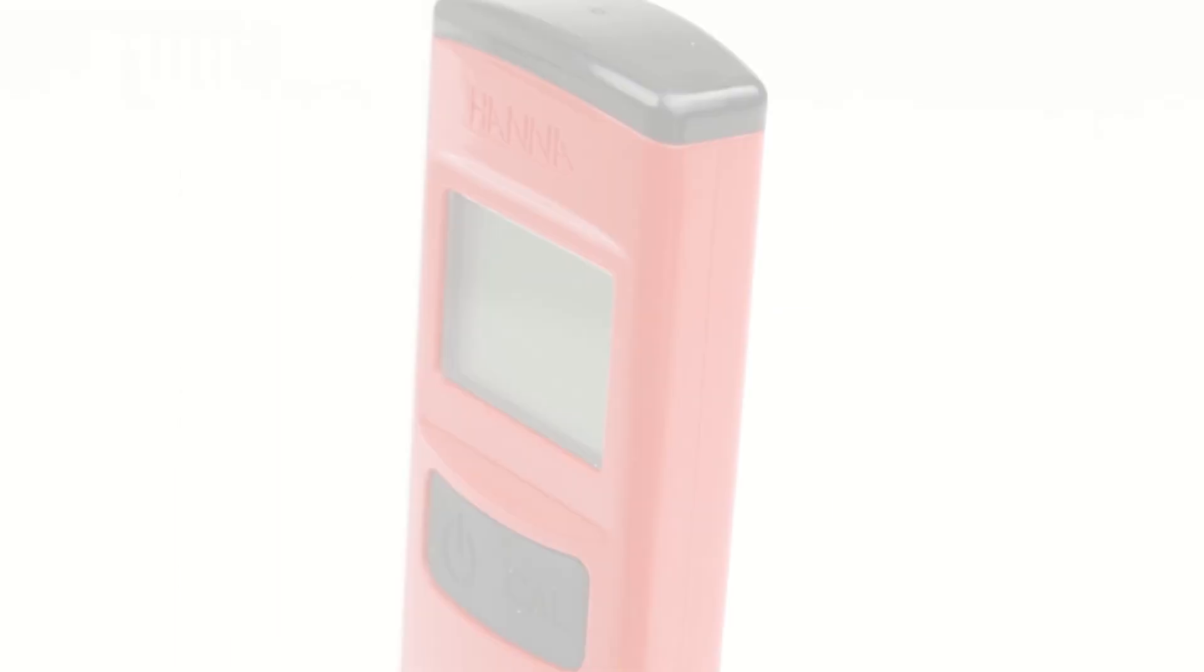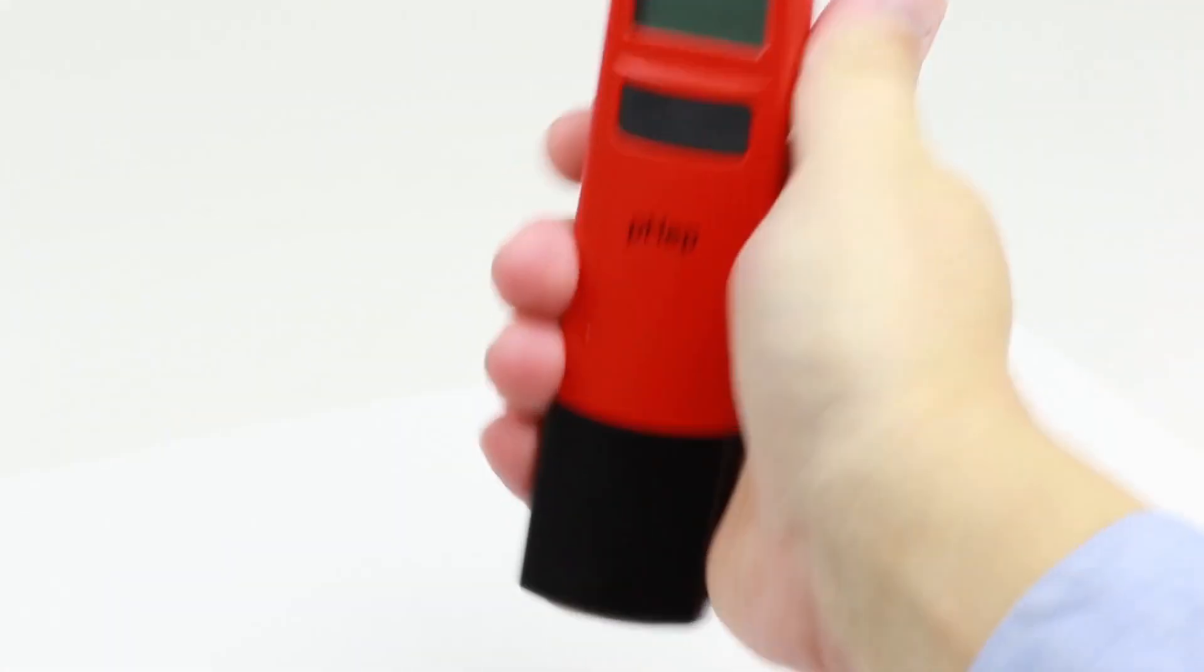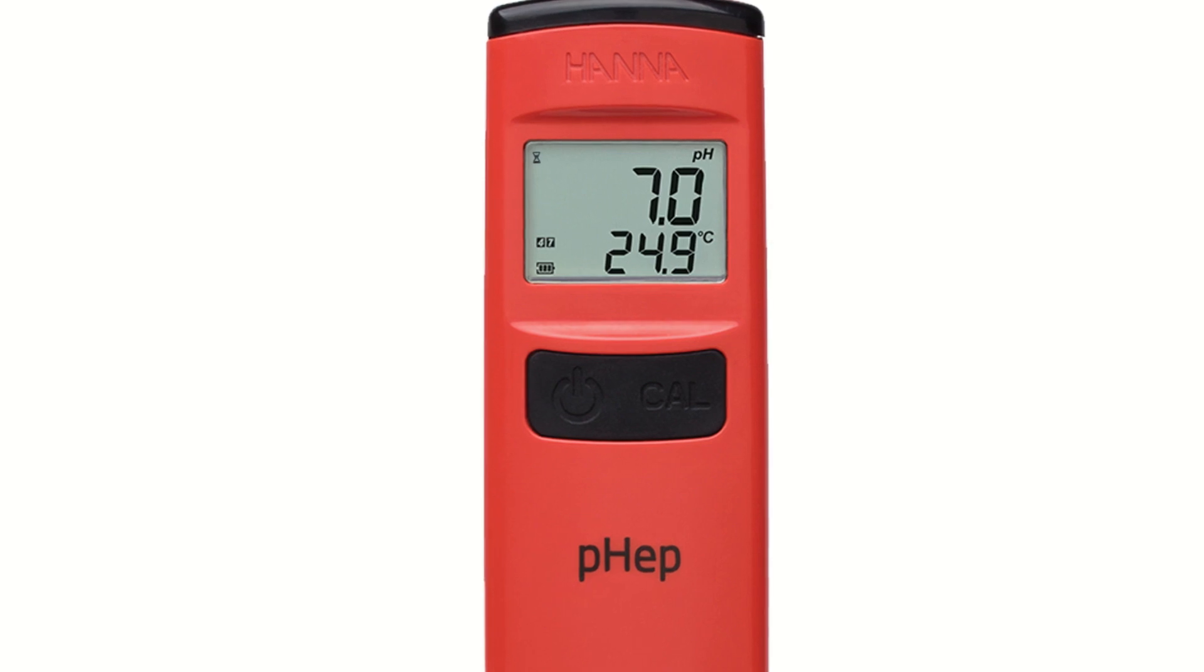The pHep meters are designed with accuracy and simplicity in mind, starting with a slim ergonomic design that fits comfortably in your hand and a high contrast, large display that is easy to read.